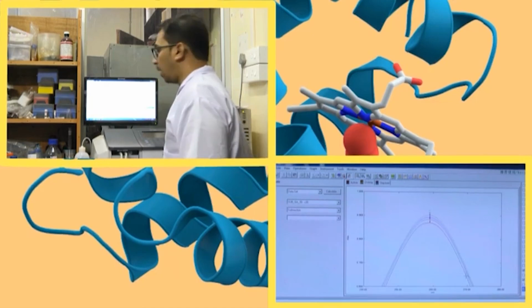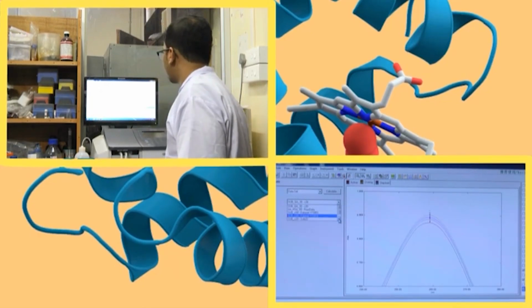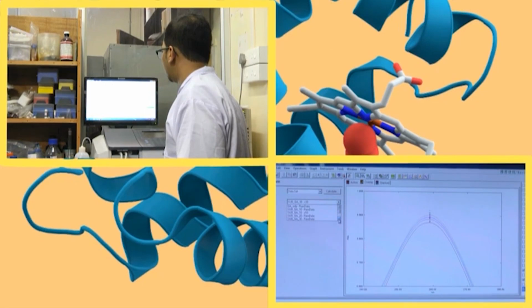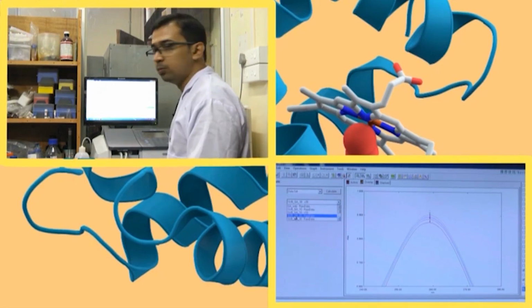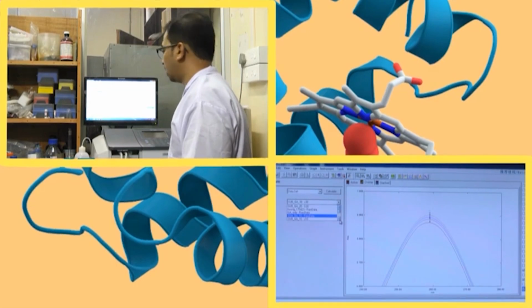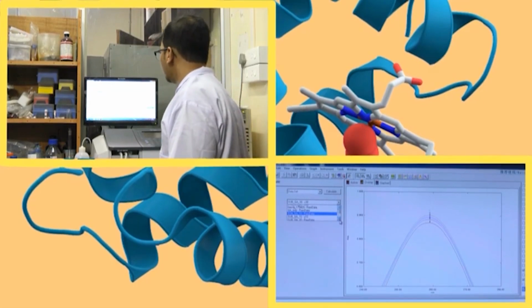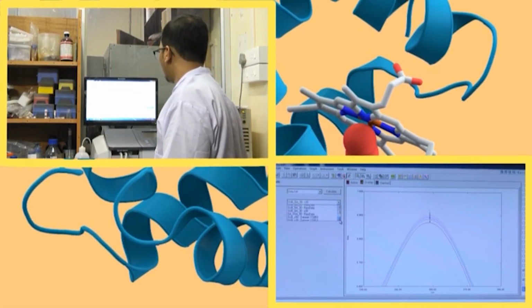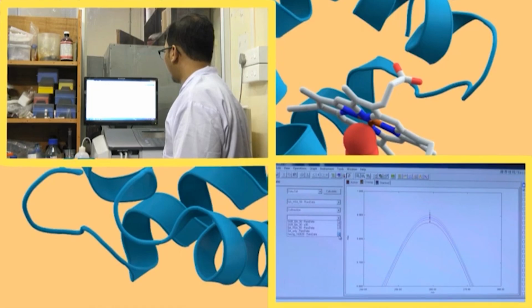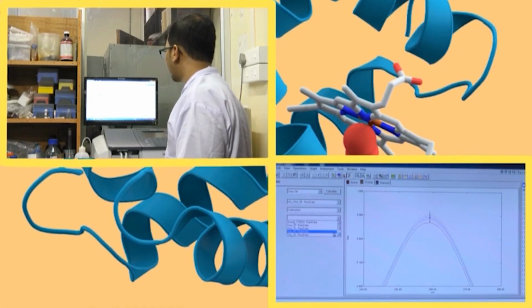And the final one here is 50. So, we have to search from here. So, how do the files come? Files basically come out here in the way that you have arranged their names, and according to the names this comes. Okay, so you will be searching for GA. Okay, it just went up here. GA HSA 50, and from there HSA only 50.